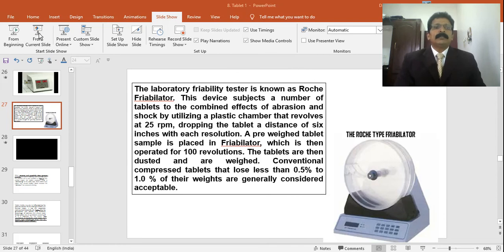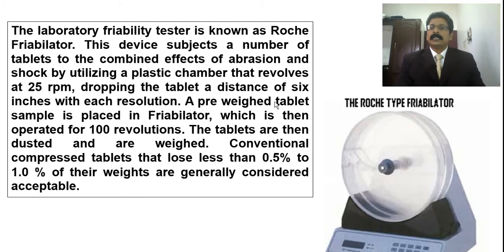We have seen this is a continuation class of last Saturday, and we have discussed in the last class up to hardness of a tablet, how to evaluate by means of Monsanto, Pfizer and automatic machines which are available, and we just continue with the Friability Tester.